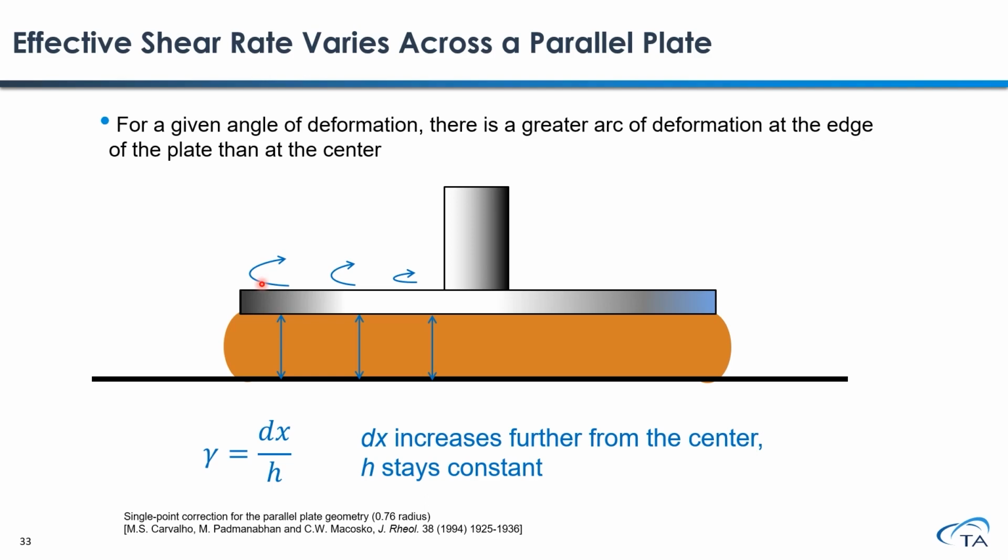So therefore, if you use a parallel plate to measure a sample's viscosity, especially if this particular sample's viscosity is shear sensitive, you may see a slight variation for parallel plate results versus the results measured using a cone plate. But these differences can be corrected back by using TRIOS software. That is a very simple Rabinowitsch correction, a stress correction. The software will correct it back for you.